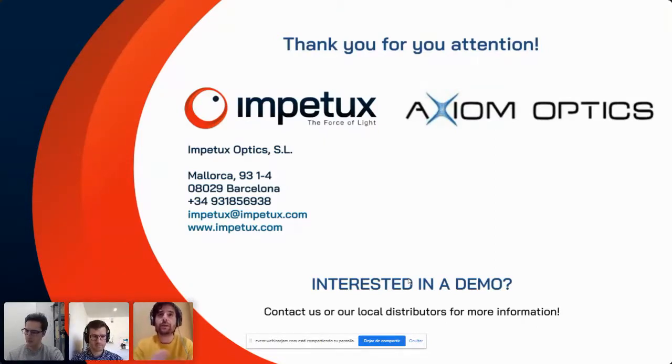Typically, we recommend to keep the laser power at a level which is not toxic, but allows you to exert high forces. So it allows you to apply forces comparable to the forces governing cells, or molecules at this scale. Typically, 100 to 200 milliwatts is a reasonable value. But it's something you have to take into account for sure.